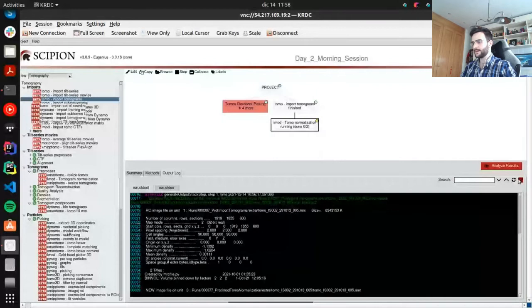Thank you. Okay. It's taking some time. I don't know if this is normal or not, but if it doesn't finish, we can use another binning protocol, no problem. Though it should finish.